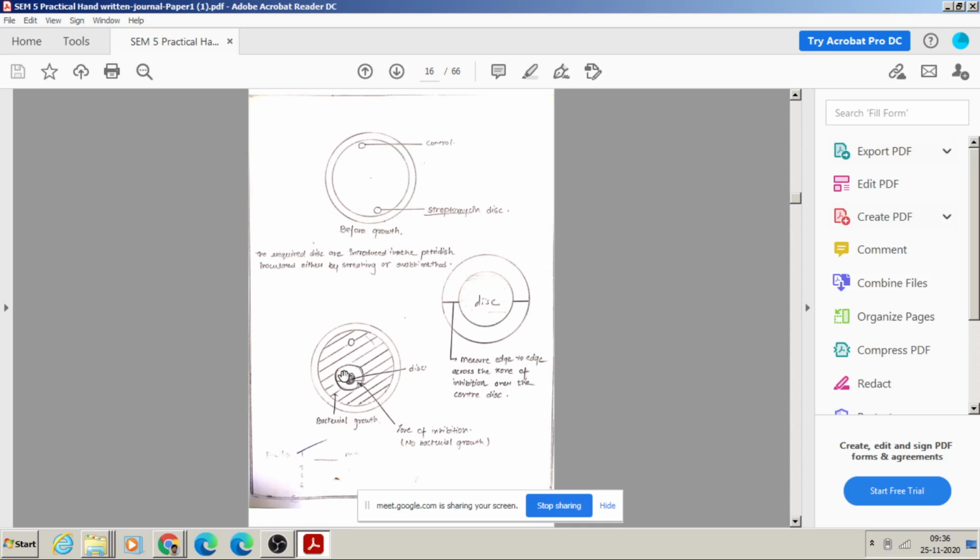So dear students, the study of antimicrobial compounds by the method we have used here, applying the disc, is referred to as the disc diffusion technique. Now why is it called the disc diffusion technique? The answer is very simple. See here, this was the disc, and I have tried to magnify it. The disc is kept here, and surrounding it is the petri plate, on which microorganisms grow everywhere. But toward the periphery of the disc, up to a certain distance, the microorganism grows, and after that it cannot reach toward the disc because there is an antagonistic compound.